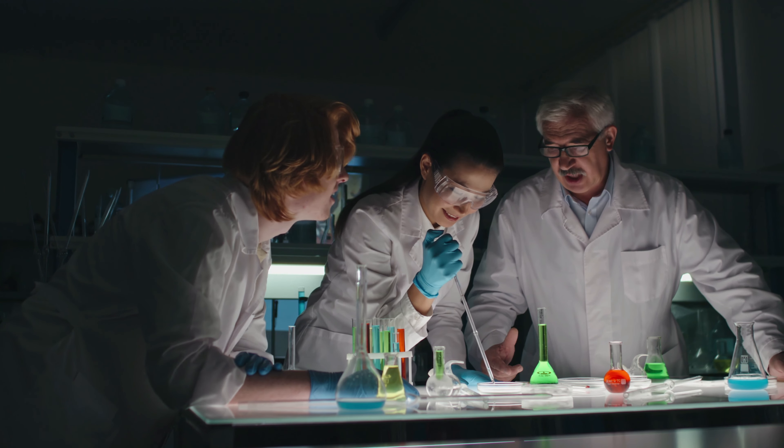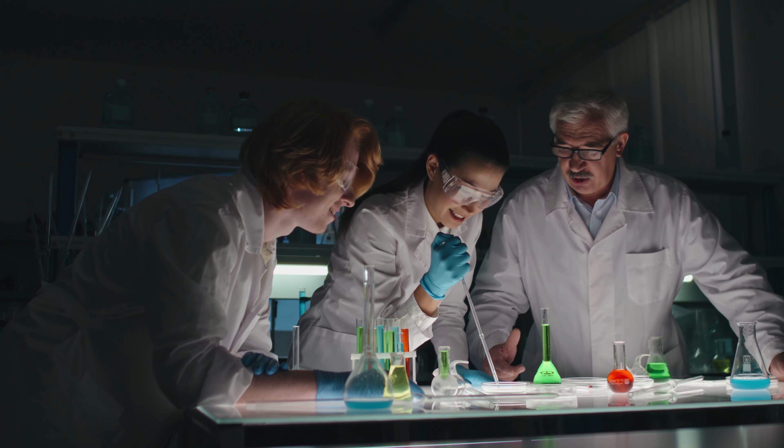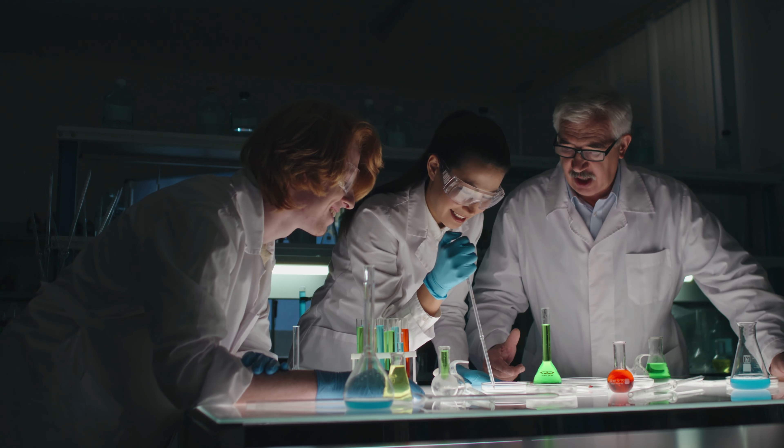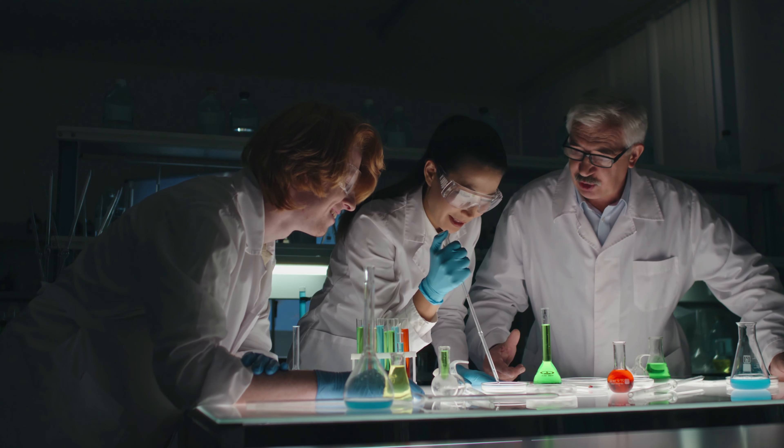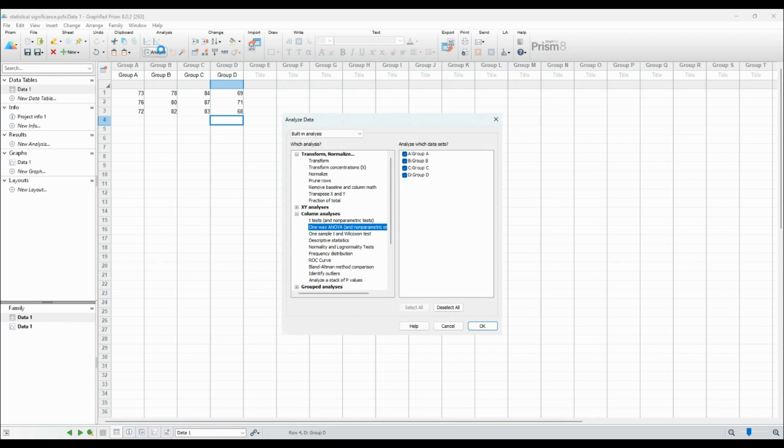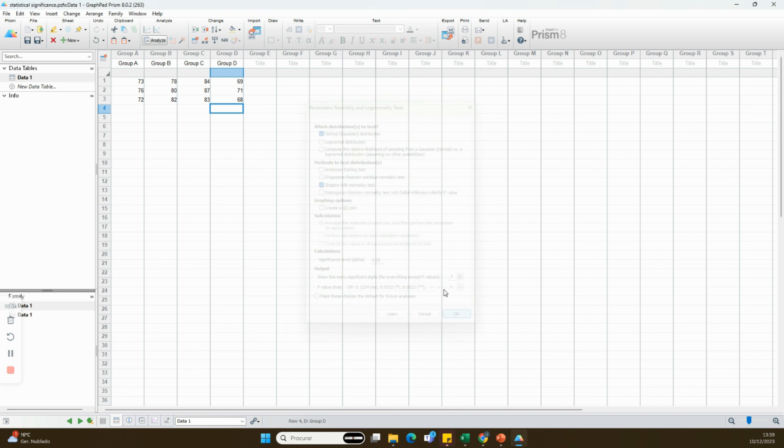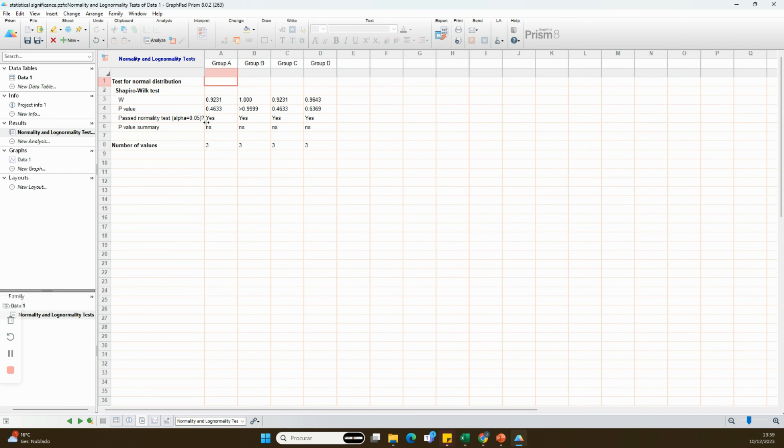Visualizing statistical significance in your graphs is crucial because it helps your audience understand the reliability of your results. It adds a layer of credibility to your findings and makes your data more interpretable.